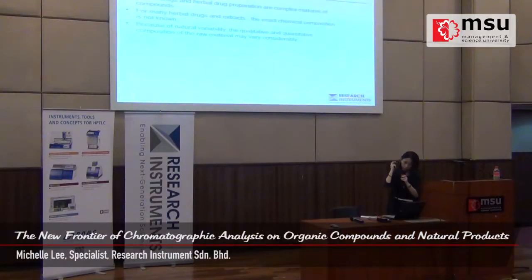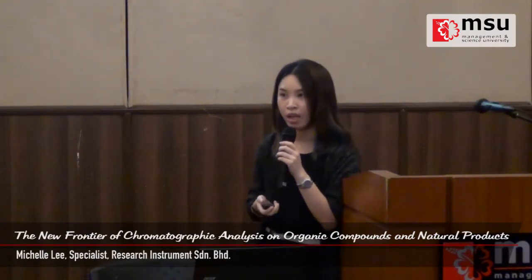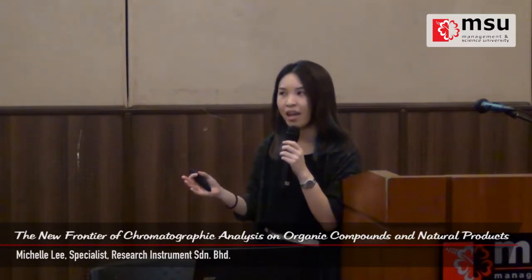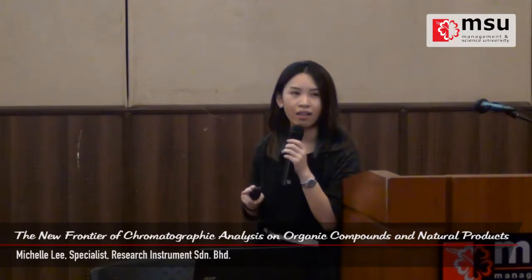So just to share with you a typical application in the herbal analysis. Why is HPTLC really good for natural products and botanical samples? I would say mainly the reason is because these are natural products. First of all, there are a lot of components inside, and second, most of the components are unknown to you as well.